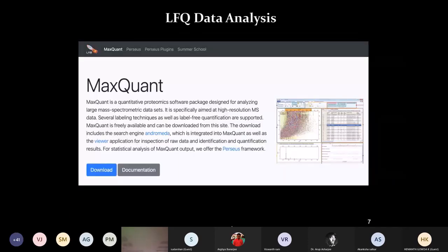All right. So you got some idea that there are many parameters to play with here, and especially at the MS and MS/MS level, you have multiple options to look into for the collision energy. That's where I think most of the time the major attention has to be paid, regarding what collision energy you want to use. For instance, when you are using iTRAQ or TMT labels, you would like to play with that so that proper collision happens for the reporter ion fragmentation at the MS/MS level.